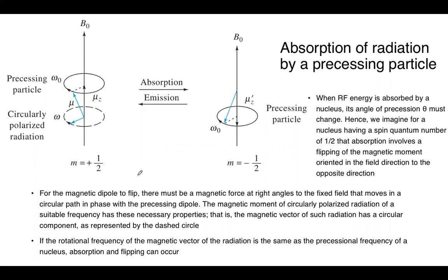It also has a magnetic field intrinsic to itself, which we've also seen is possible because of the spin number. We'll mostly focus on proton NMR here because that is by far the most common form, and it is also incredibly useful. So there are two spin states for the proton nucleus when it's in a magnetic field: spin up and spin down.